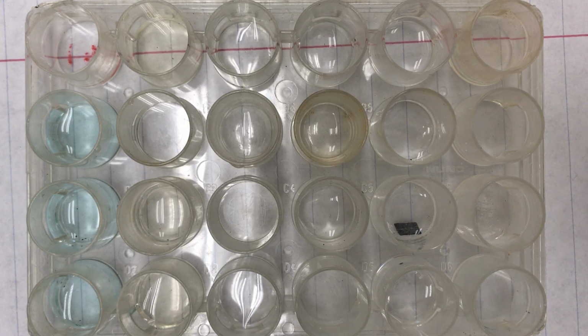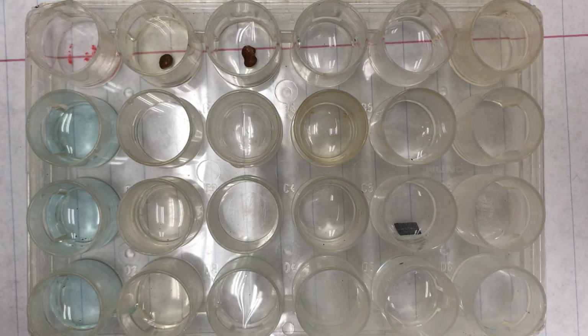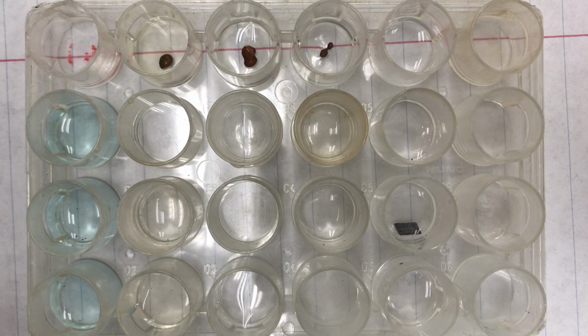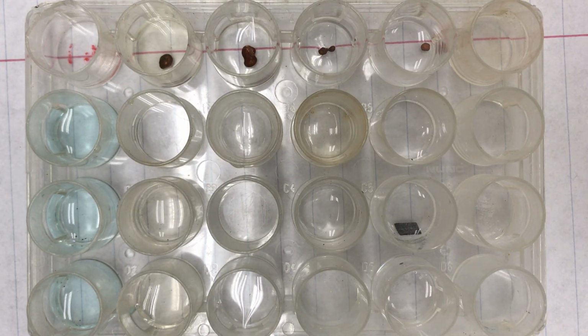Step number 4 asks us to place 1 to 3 small pellets of copper in each well in row A. All right, so here's our copper. Make note of the state and the color as they go in. Remember that a reaction may not happen right away, so you should always come back and check it later.